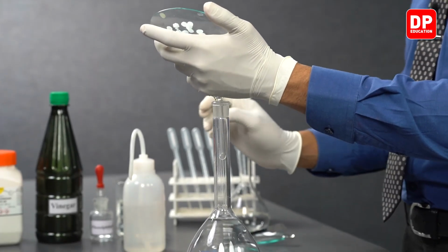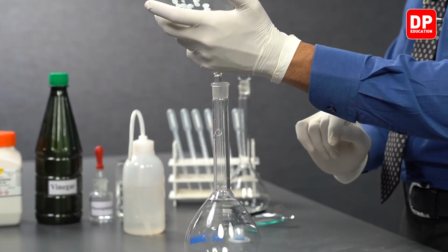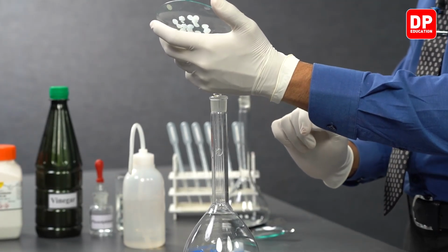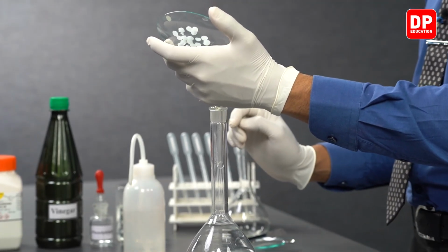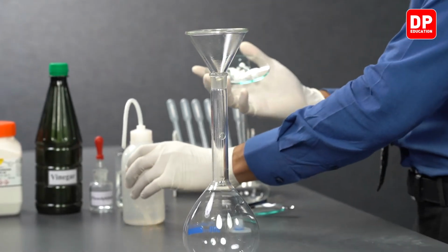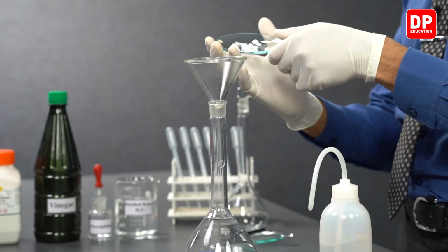We'll lift both the funnel and our watch glass with one hand like this, or if you want to have a clearer view, I'll try to do it with my other hand, with my right hand.